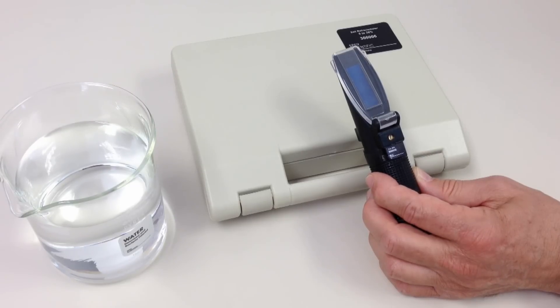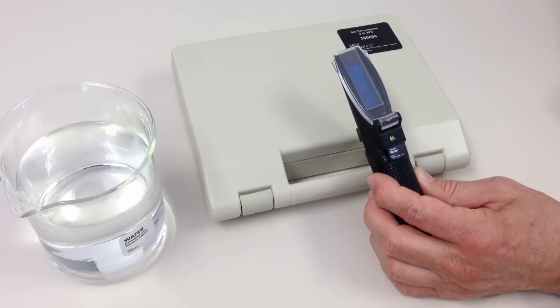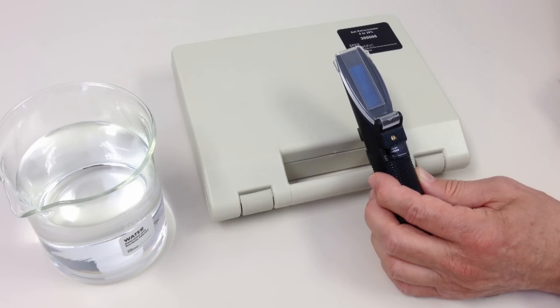Refractometers measure the concentration of a dissolved solid in water by measuring the angle at which the solution refracts light. Each model is calibrated for a specific dissolved solid, for example, sugar or salt in agriculture and the food industry.